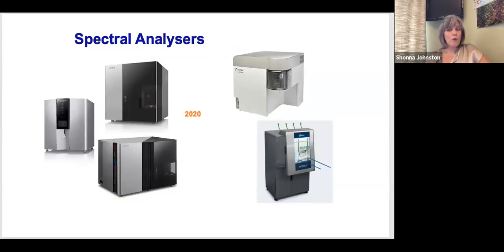So we move forward now to today, 2020, and the first spectral analyzer that you saw in the previous one was actually a Sony spectral analyzer. They've now added to their portfolio with a couple of extra ones, most recently the ID 7000. You've got the Cytek Aurora here, and we've also got the Bigfoot by Propel Labs. So as I said earlier, my experience is obviously of the Cytek Aurora.